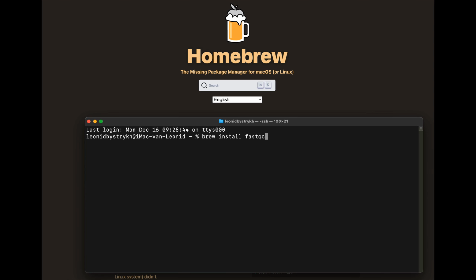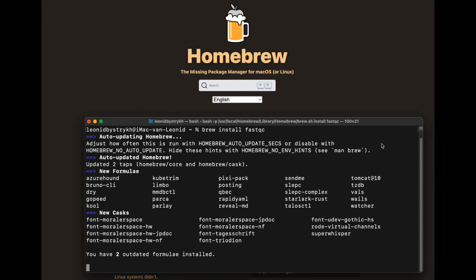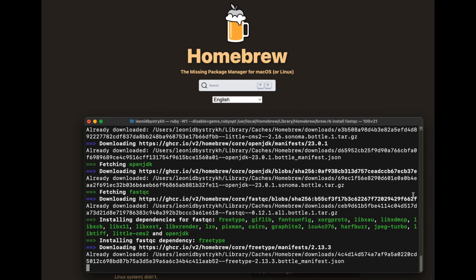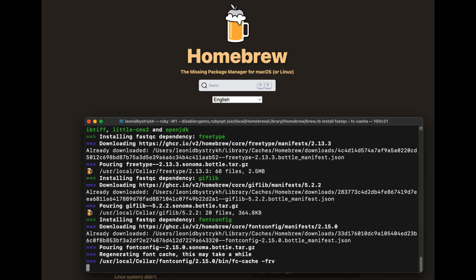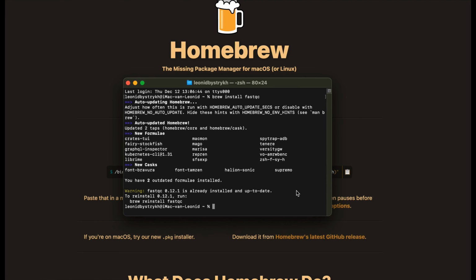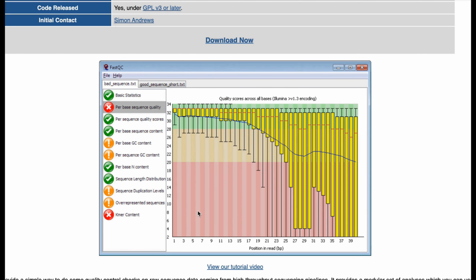The next step is how you use fastqc from the command line and why. You notice that the whole point of using the fastqc program is generating a report, and you can do it from the command line.